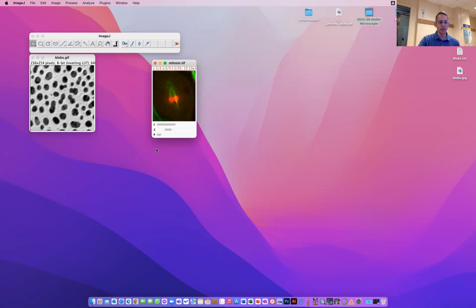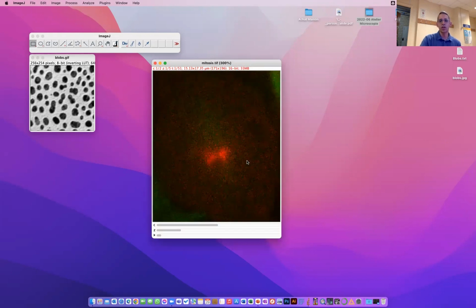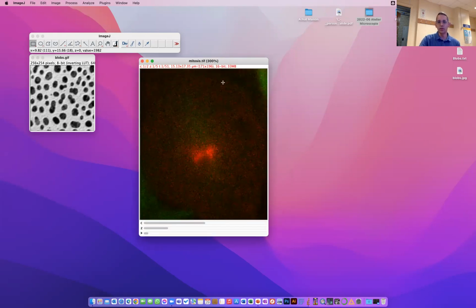Oh, I switched to French. I showed how to switch dimensions, because this is something important. One of the dimensions we can switch is actually intensity. You can change from gray level to color, which is actually a new dimension for us. You can also change, and I showed how to visualize color in 3 dimensions as a volume, and this is also a change in dimension.